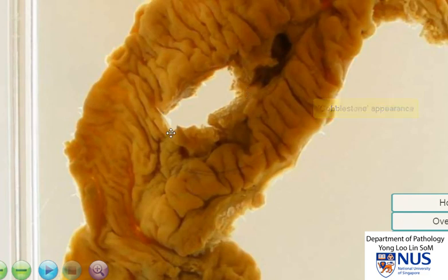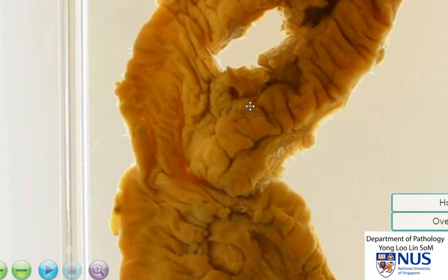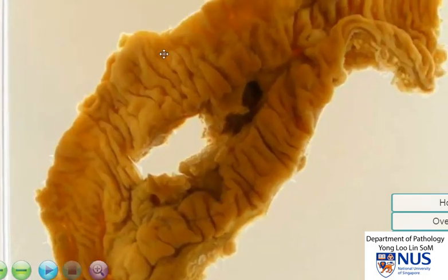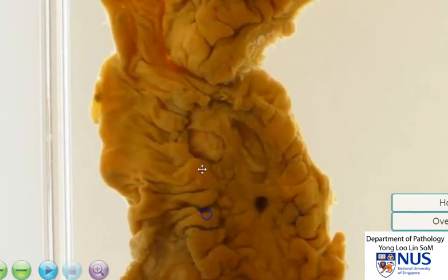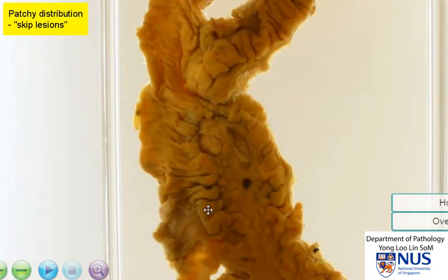In this region, there is a full thickness defect because a section has been taken out for microscopic examination. We can also see that there are other areas that appear fairly normal in between the abnormal areas. Here is an area of ulceration and this is relatively normal mucosa. So the type of distribution is actually patchy, and we term these as skip lesions because there are areas in between the lesions that are skipped or relatively normal.